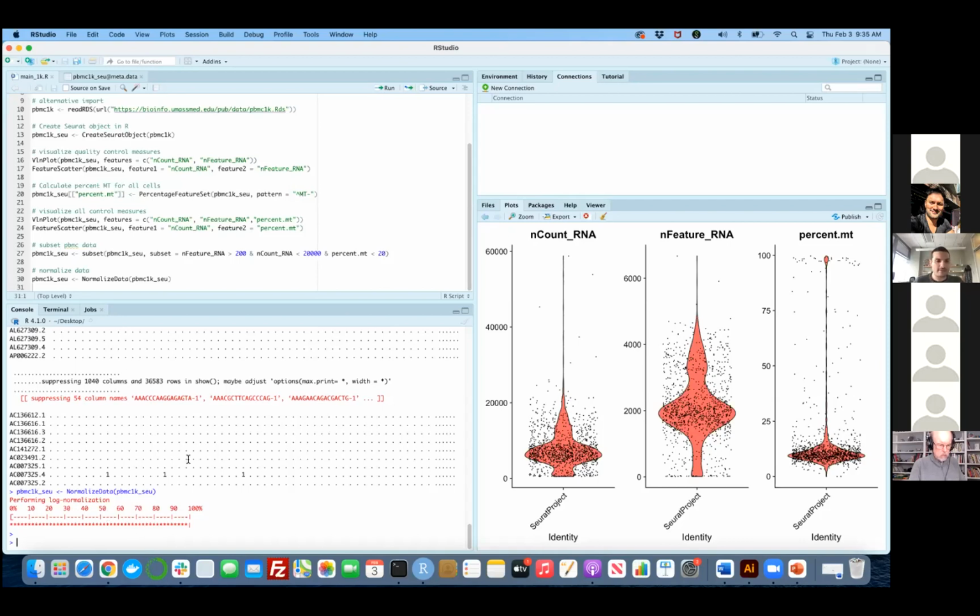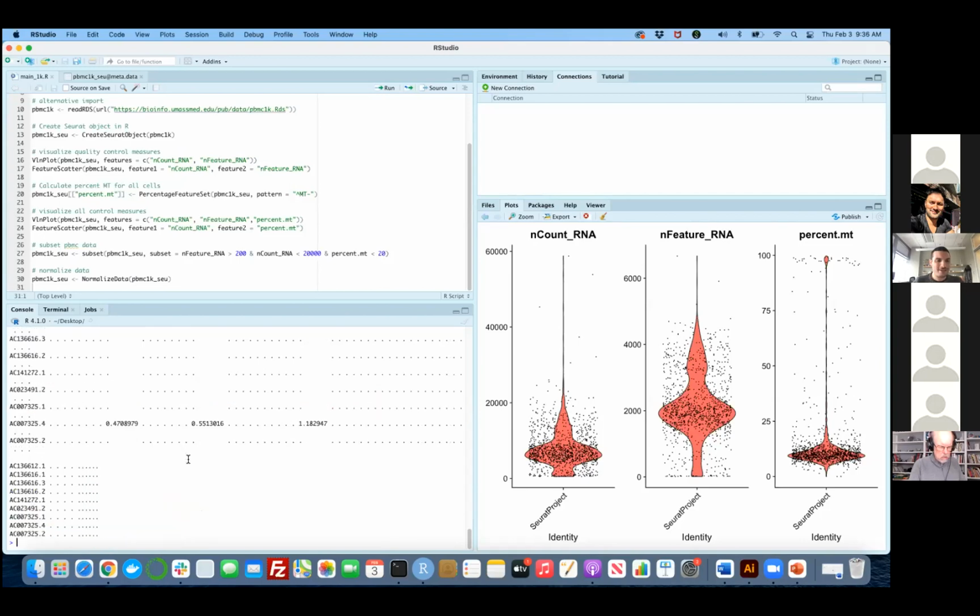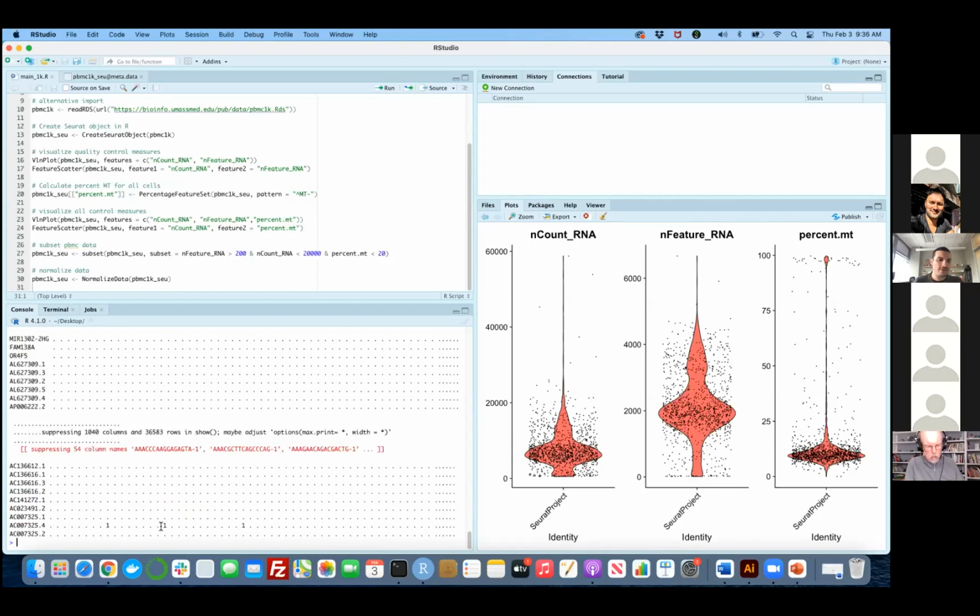So what happened? Let's take a look at the same part. Again, you type the Seurat object, you click on assays, then you click on RNA, then you click @ again, but now you're going to click on data. As you see, we don't have raw counts now, we have normalized counts. But if you take a look at the counts instead of the data, we still keep the raw counts here. So it's quite interesting.